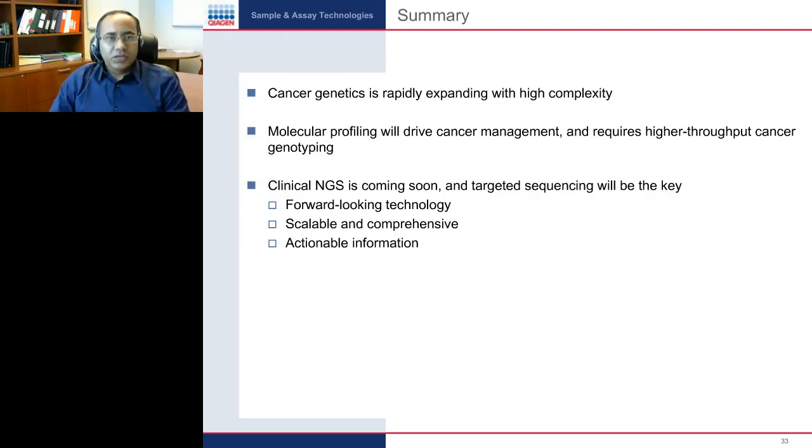One question is whether the QIAGEN GeneRead QuantiMize kit is RT-PCR based. No, actually this is just qPCR based. It is for quantification of DNA and looking into the quality of DNA.